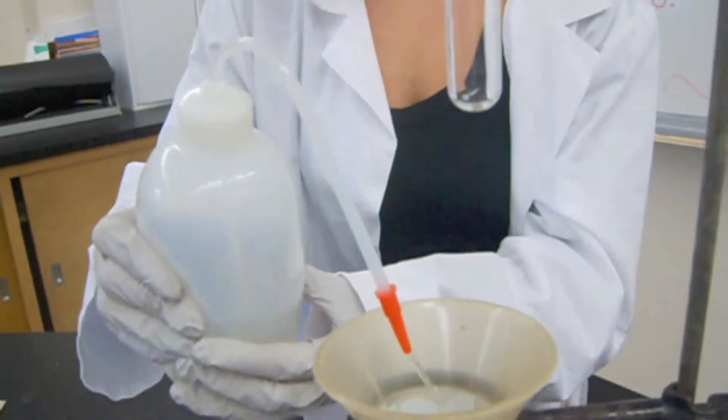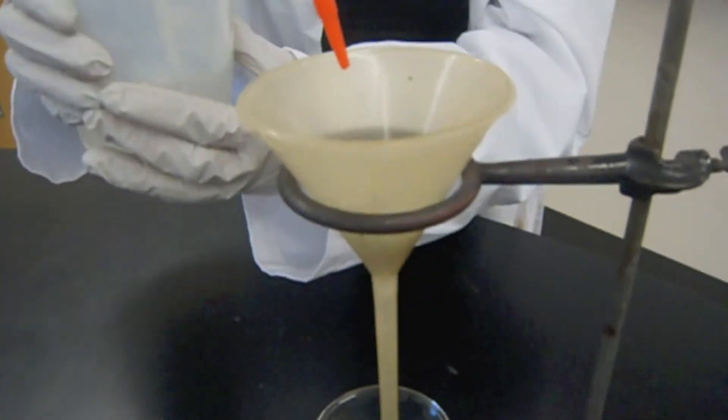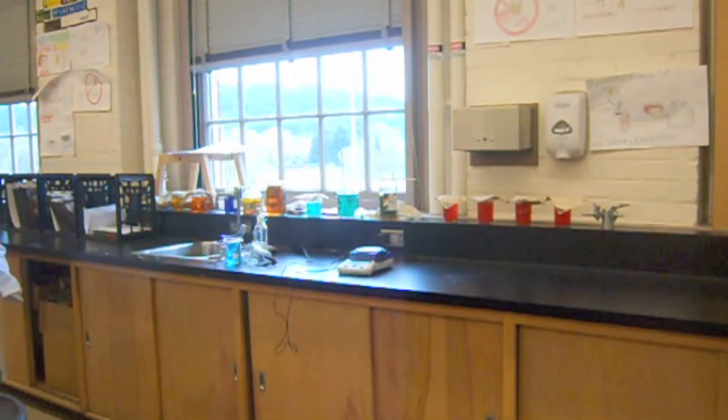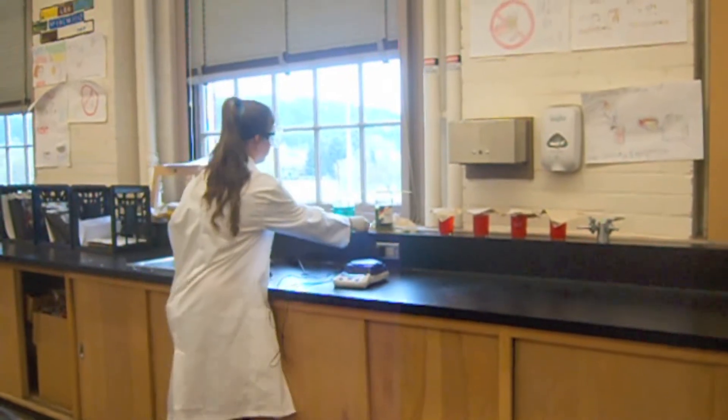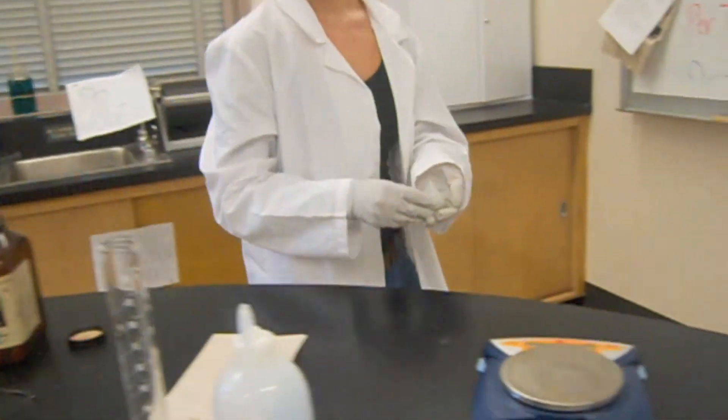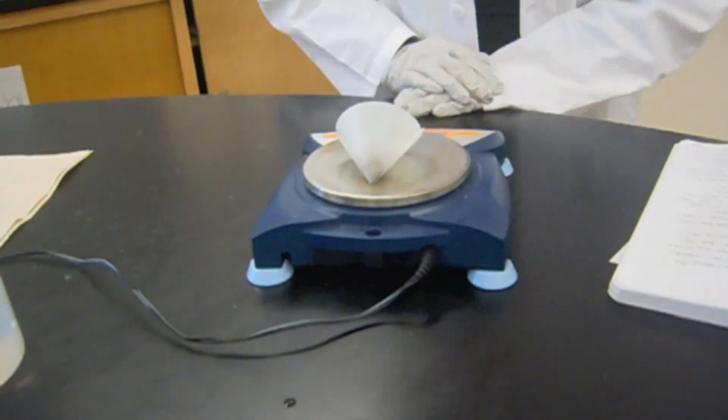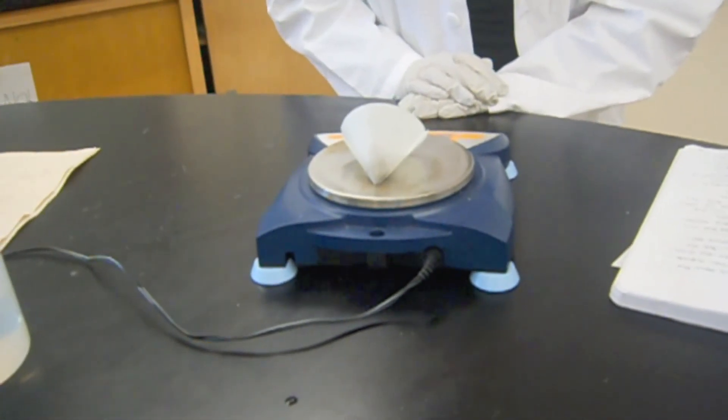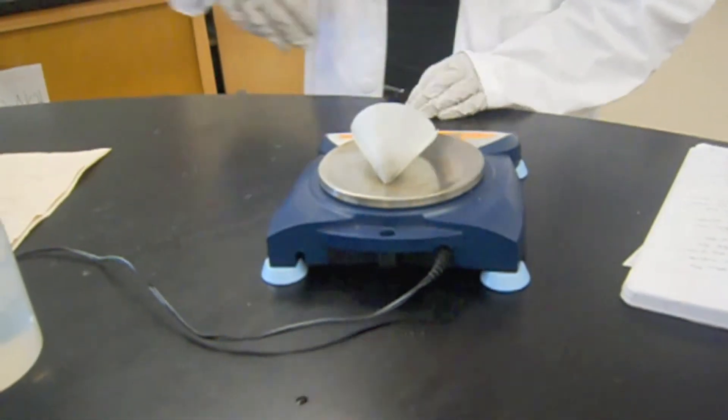Rinse the silver and the filter paper with distilled water. When everything is dry, weigh both the copper and silver. Record all results in the data table.